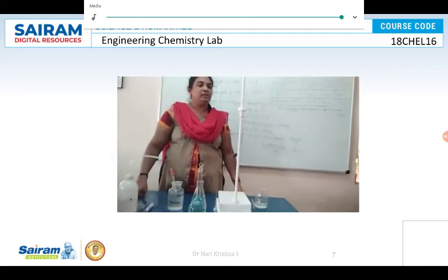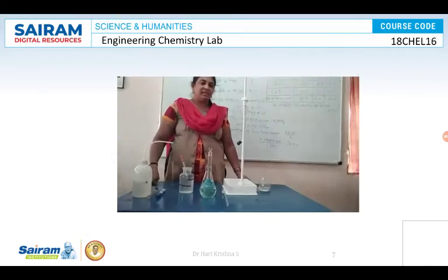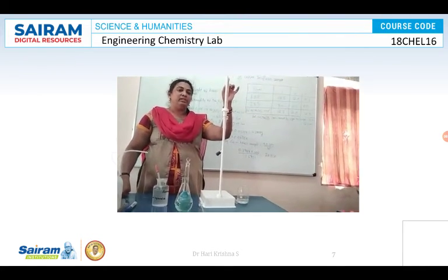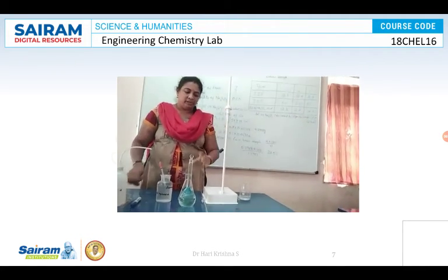Given standard sodium thiosulfate solution. You don't have to prepare standard solution here. Standard solution will be given to you. So fill the burette with the standard sodium thiosulfate solution.